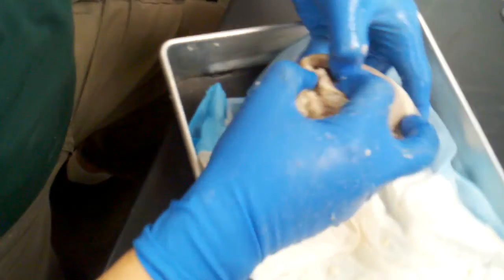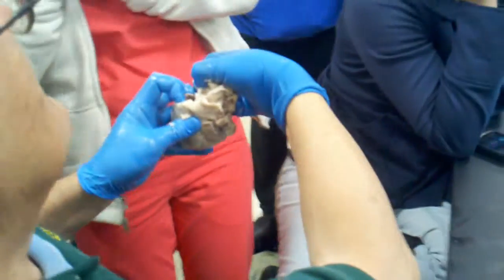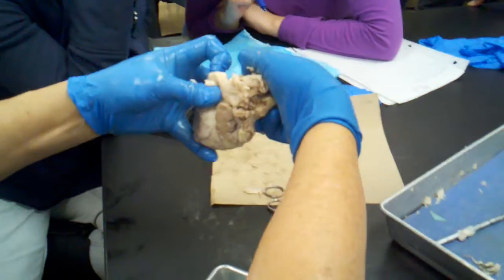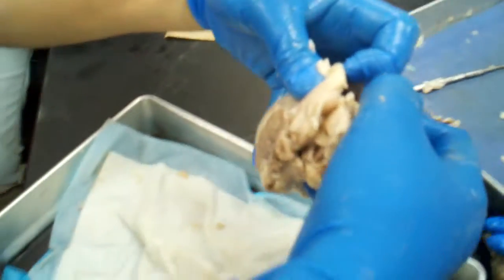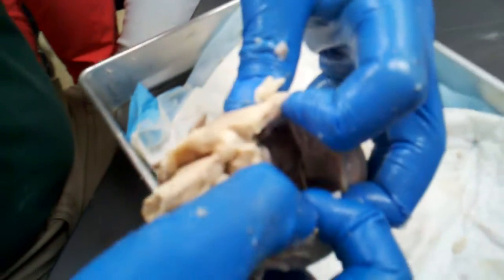Now, what I'm actually doing is cutting into that pulmonary trunk, and some of you, without me pointing to it, can you see something that looked like if you had a blister, but the fluid was drained off? Do you see what looks like a little bit of flap of skin, almost like the leaf of a blister? Do any of you see it? Yes or no?